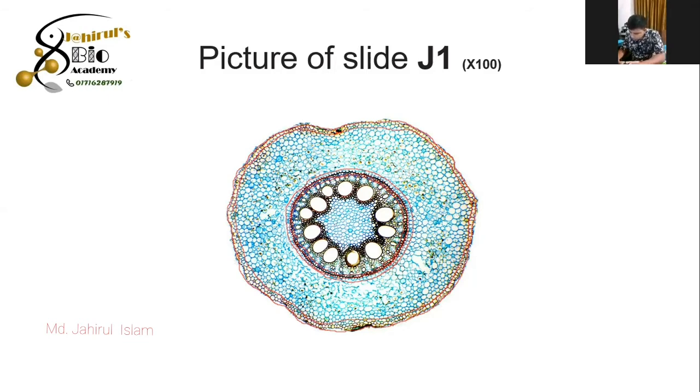I'm going to show this is xylem, the red color cell, that is xylem. There are a lot of xylem, but you will not draw any singular cell. The big size cell that you are observing is also xylem, but you must remember you will not draw any singular cell. Okay, then I'll just draw a few phloem. You see, this is the phloem, so you will just draw some phloem.